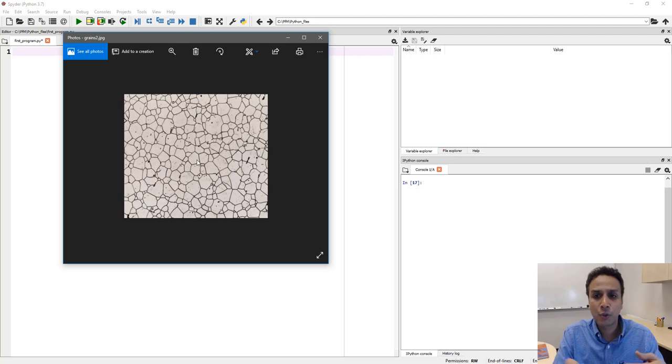And when I mention scale, it's also important for us to define the scale in this case, right? If you ask me what is the average grain size of grains here, if I say it is 200 pixels, what does that mean? But if I say the average grain size is 0.85 microns, that does mean something to you, right? So that's why we should also keep track of the pixel size when you work with microscope images.